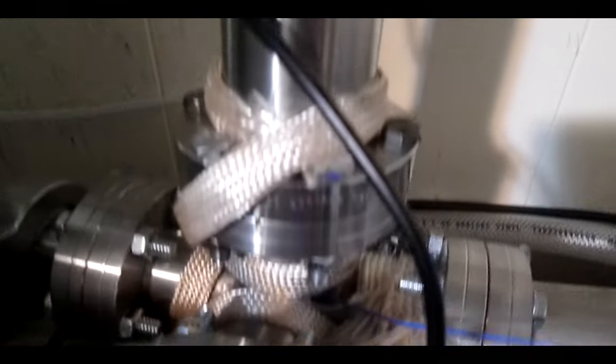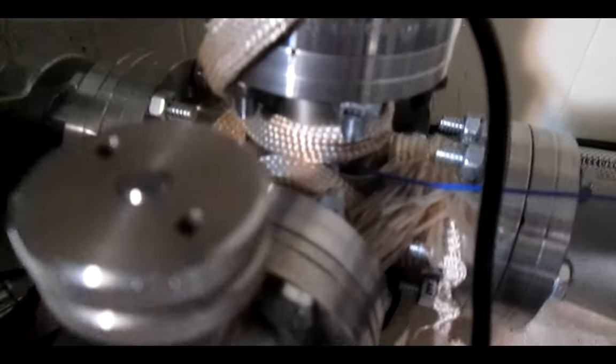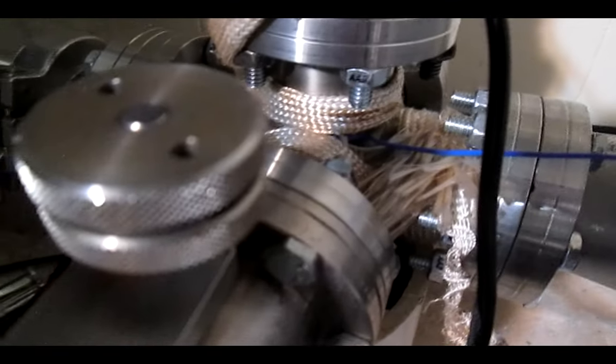So the RGA is really a small mass spectrometer designed to identify source pollution in vacuum systems, and for that purpose it does not need any sample introduction.